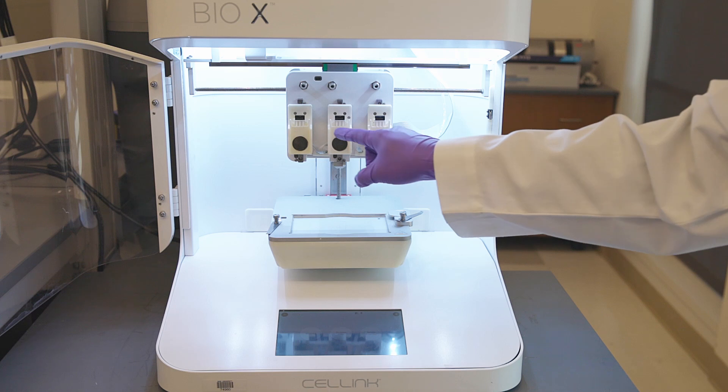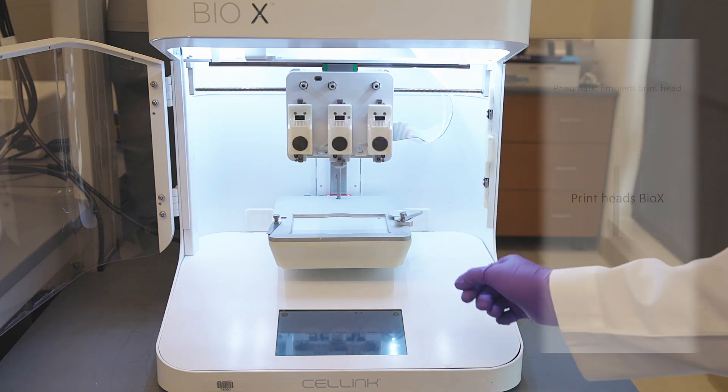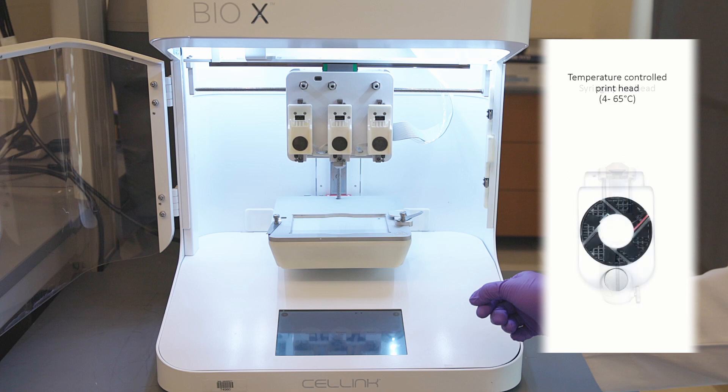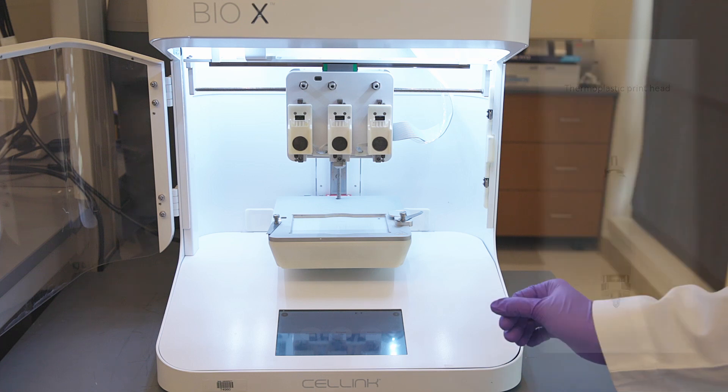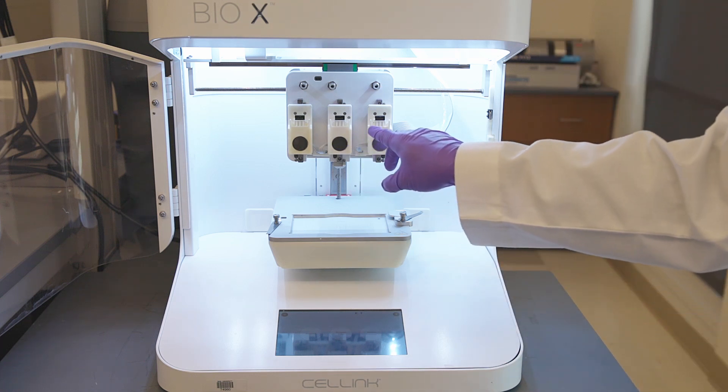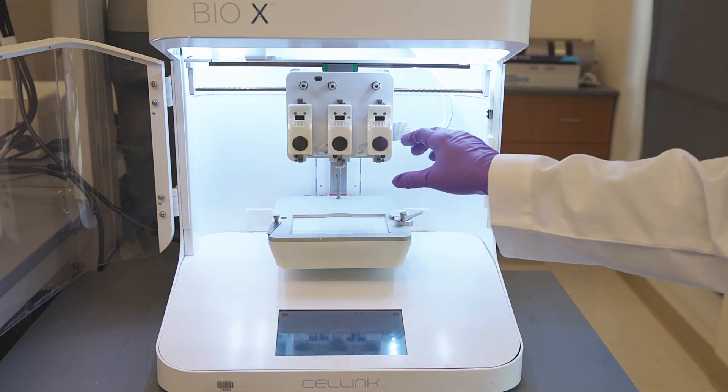Here are our printheads. We have multiple printheads such as the pneumatic printhead, electromagnetic dispenser, syringe printhead, temperature control printhead, UV printhead, and thermoplastic printhead. We can accommodate three different printheads at the same time.